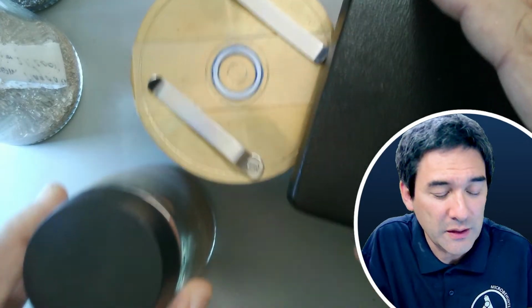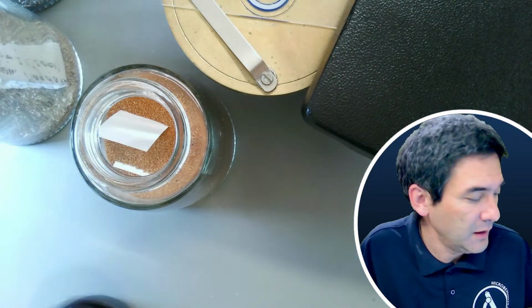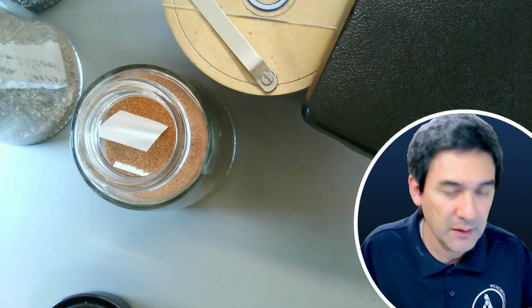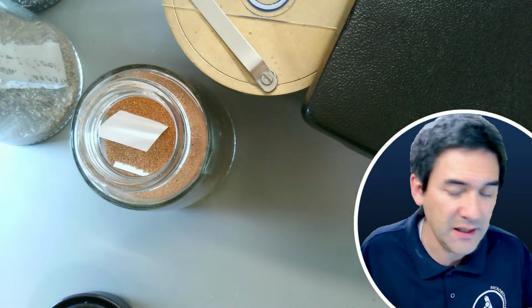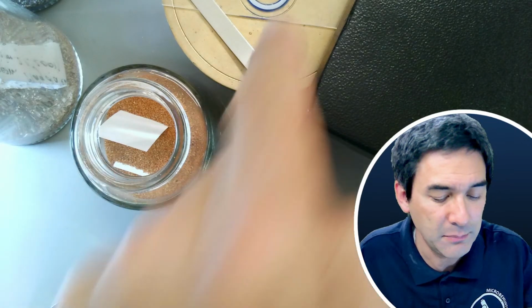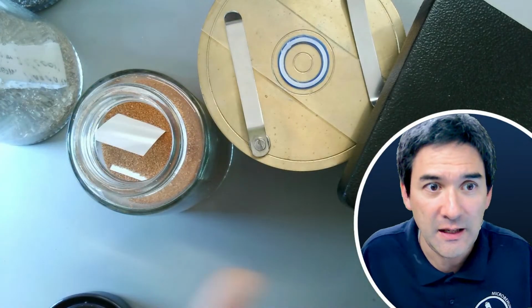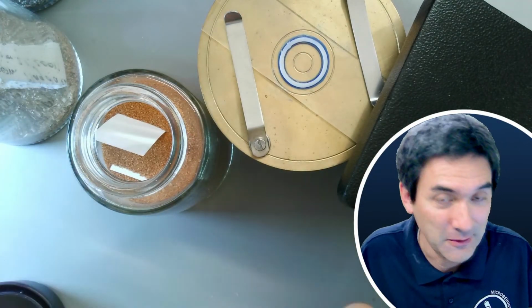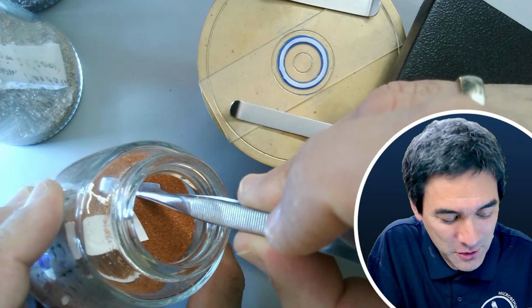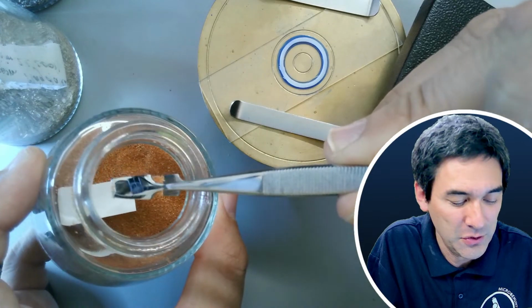You don't see that, what I'm doing right now. I'm basically opening this one up here, and this was a present over 20 years ago from someone. It's a very nice sand, a very nice red sand. What I would like to do now is take out a little sand sample and put it in here, and then the cover glass goes on top. Honestly, I've not tried this before, so this is a first. Sometimes I like the experimentation. Unfortunately, I don't have a spatula, so I'm just going to use those tweezers here.